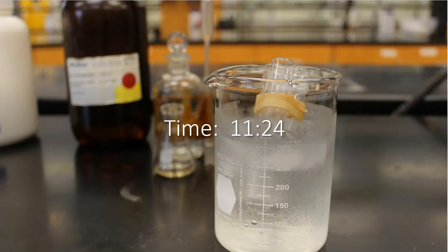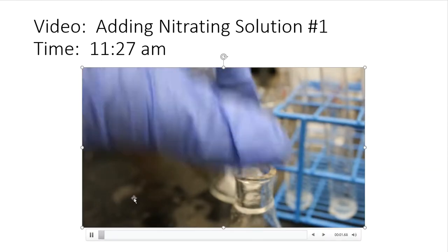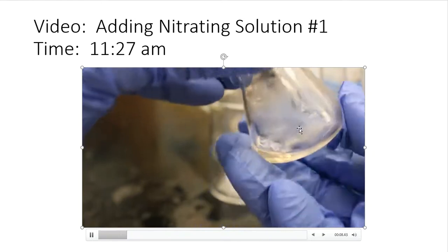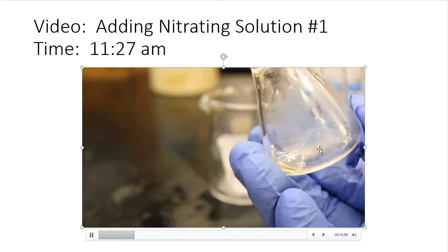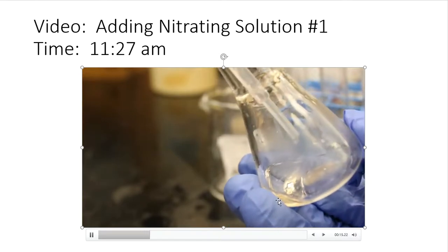There's my nitrating solutions right in there. And those nitrating solutions, there's my beaker of ice water. That's good. That's what I want to see. And I'm getting ready to add the nitrating solution to my first one, which is acetanilide. So let's take a look, see what's going to happen. So you can see my test tubes of nitrating solution on the back. I'm going to suck all of that solution up. There's a close-up view of that Erlenmeyer flask, and I'm going to slowly add the nitrating to it.